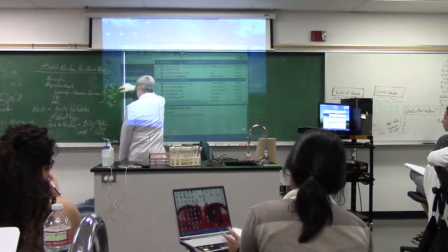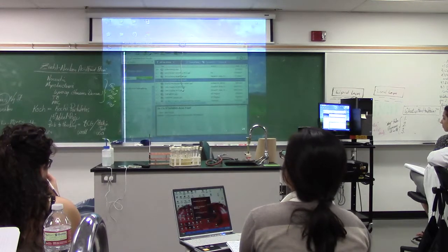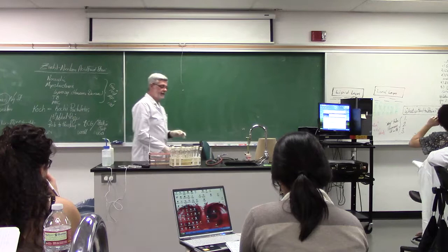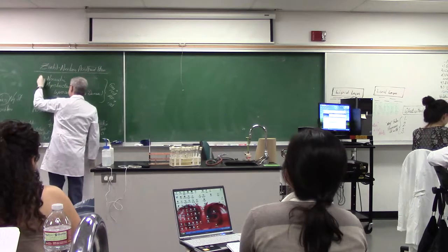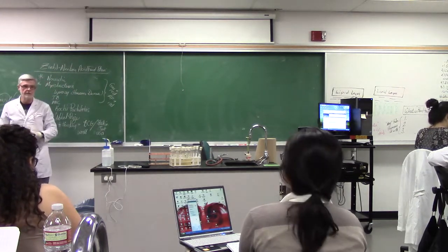That is, we're going to do everything acid-fast stain today. And we're going to be talking about the Ziehl-Neelsen acid-fast stain. It is for 2 genera. So who can tell me the 4 things that differential stains tell you? Number 1.